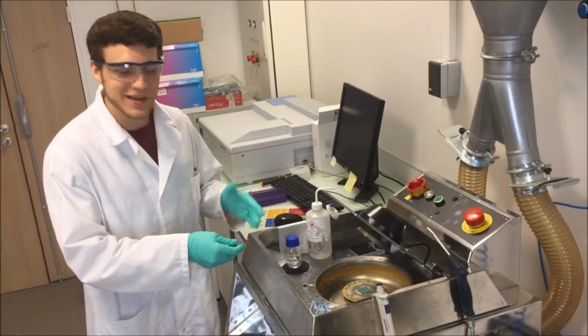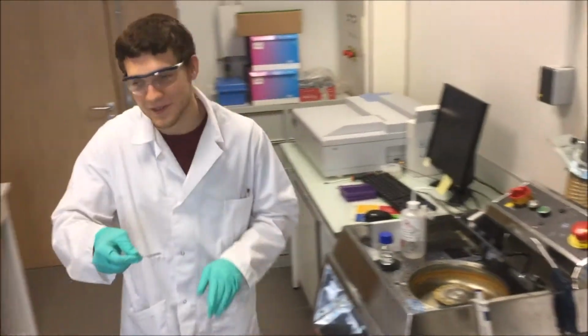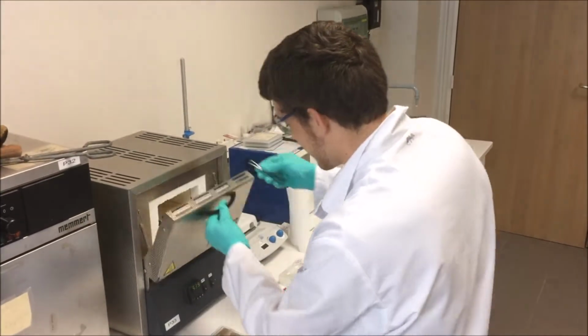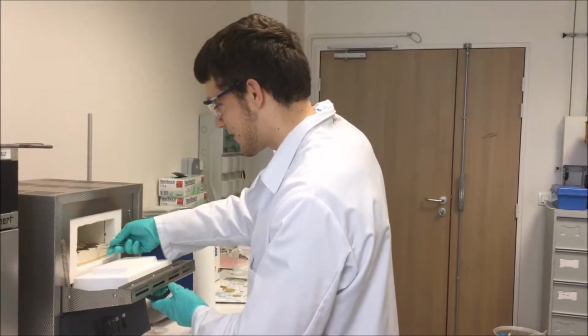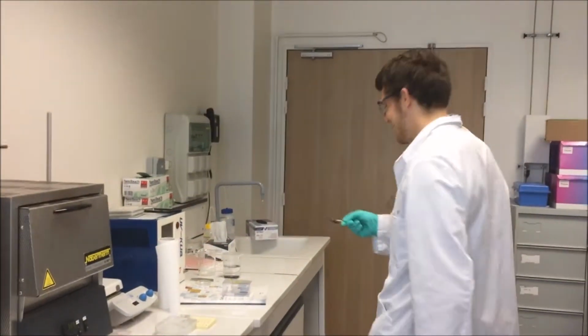Alright, so now it's done spinning, and we're going to go ahead and take it off and put it into the oven to crystallize. Alright, it's all finished. We're going to go ahead and take it out of the oven and head on to the other room for growth.